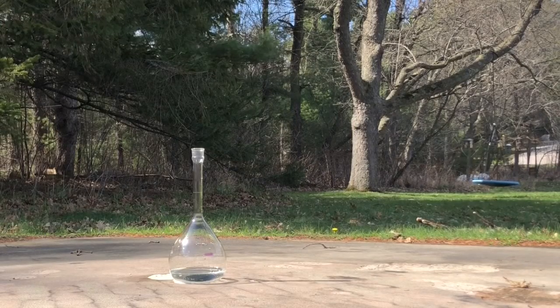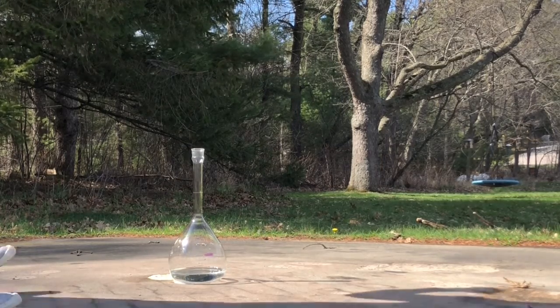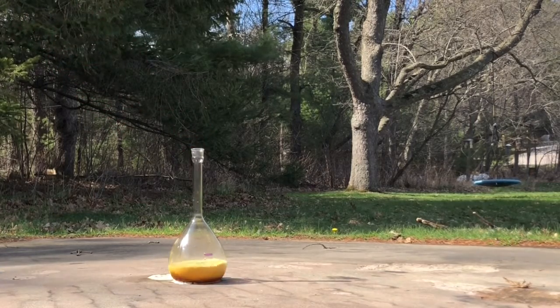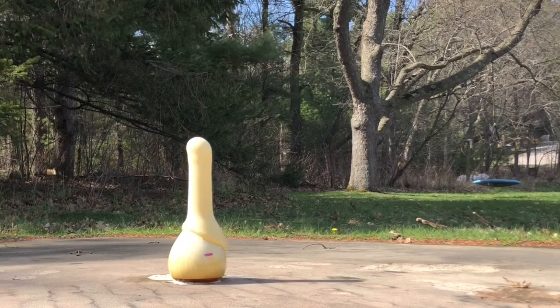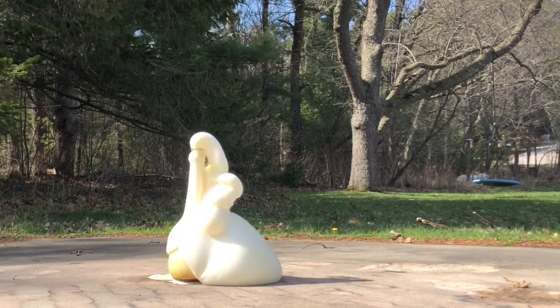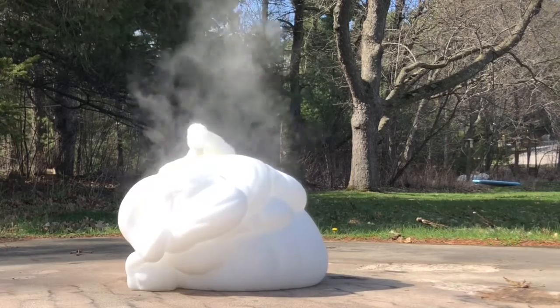Okay, now we got 30% hydrogen peroxide in our flask. I'm going to add our catalyst. This one happens a little bit faster.